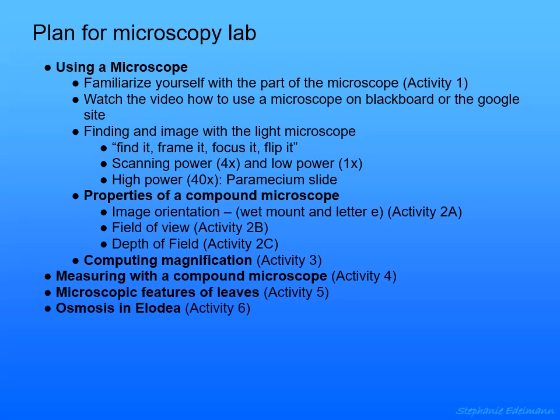There's a lot going on in this lab, and that's true for either doing this in person or doing this online. You're going to learn about the microscope in this lab, which means we're going to have to familiarize ourselves with the parts of the microscope. I've got a video to show you how to use the microscope. I also have a couple of virtual microscopes you can use to play with things.